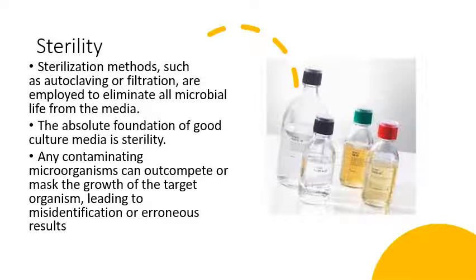Sterility. To ensure accurate results, culture media demands complete sterility, void of any contaminants, because we are specifically looking at a target organism. Hence, the media must be sterile to ensure that any organism that grows is what we are specifically looking at.